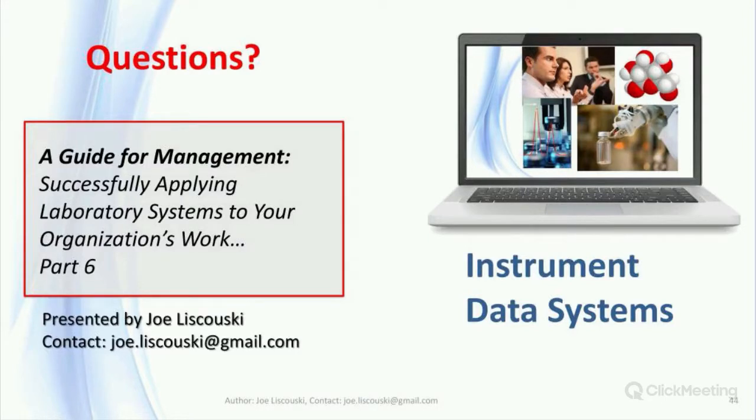The real problem is making sure that people have confidence in how your lab works. If you can't find information, then they're going to have problems having confidence in the results that you produce. If somebody asks you for information and you can provide it very readily, then they're going to have a lot of confidence that your lab is operating properly.